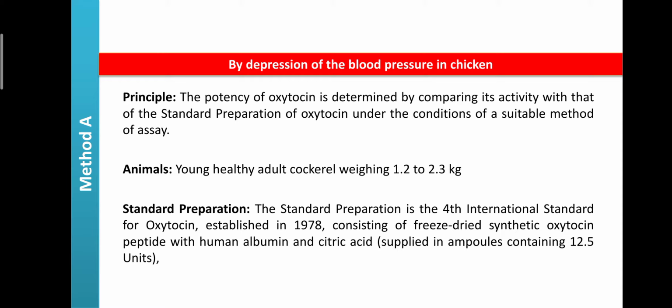So you must maintain the conditions if you are using animals, because we first do all experiments in the pre-clinical stage, that is, before human beings. All experiments are conducted on animals. If you are working on pre-clinical studies, whatever conditions are there should be maintained, otherwise your result will be false, and then your drug cannot be approved by agencies like the FDA or the respective authorities of the particular country.